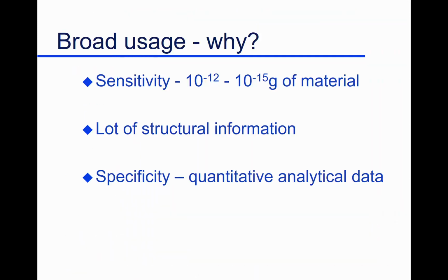Well, sure. So sensitivity, again, that's not bad. 10 to the minus 12, 10 to the minus 15 grams of sample. That's adequate. You get the data you want from a small amount of sample. And you do get a great deal of structural information. So identity, hopefully, and certainly structural information.